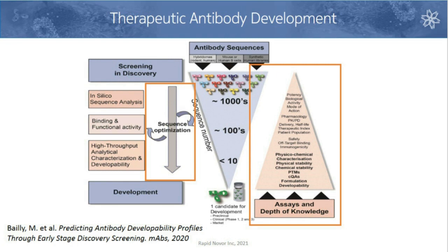We've been working with COVID-related projects, as most people have, throughout 2020 and 2021, and those results are forthcoming. Using our approach, we worked with a number of convalescent patients to sequence monoclonal antibodies present in those patients that are highly neutralizing. And of course, we believe that we could apply that same workflow against other diseases of interest and yield similar results.